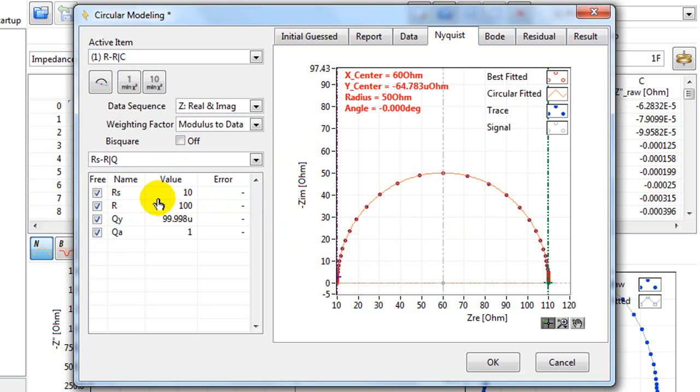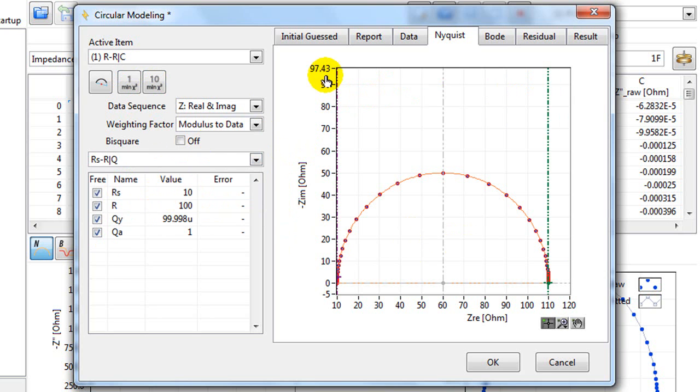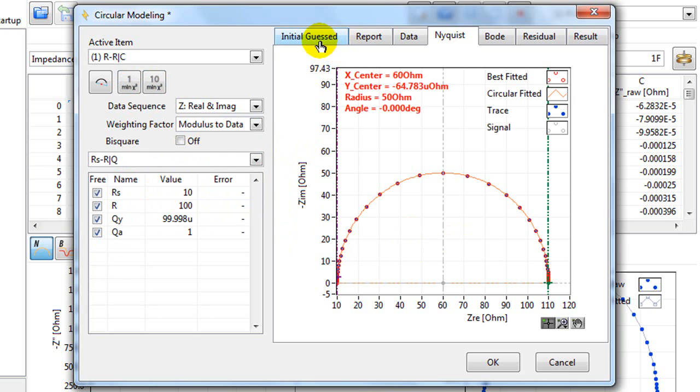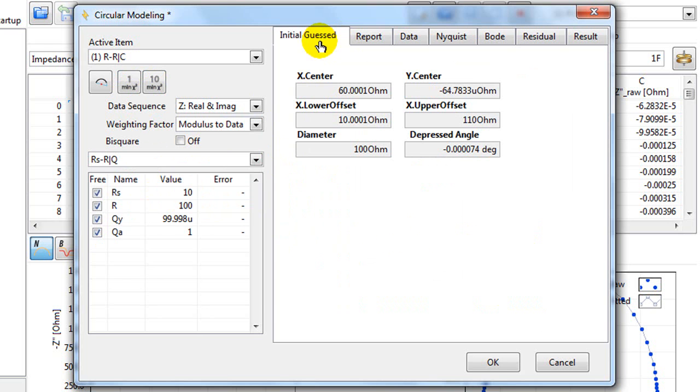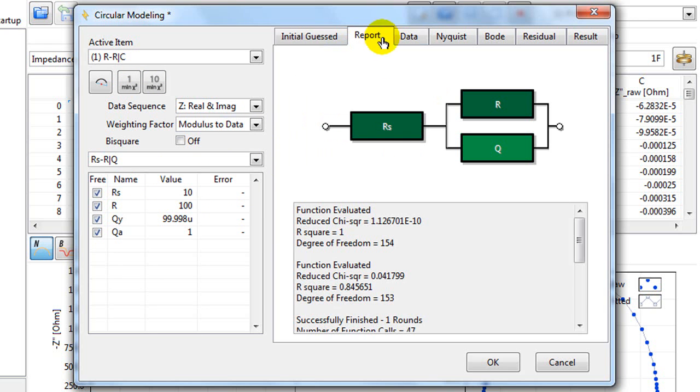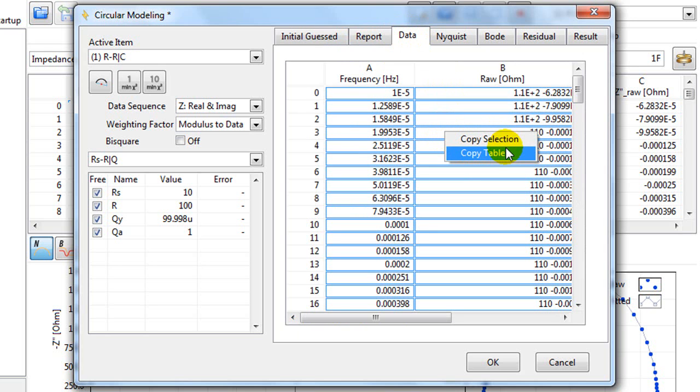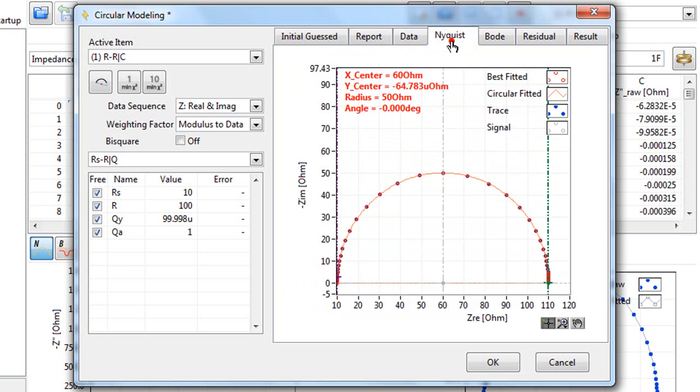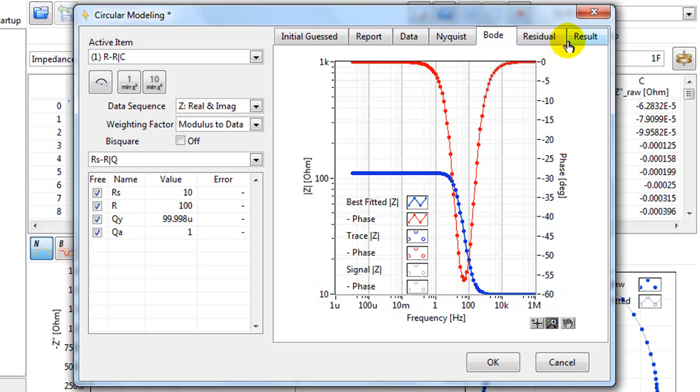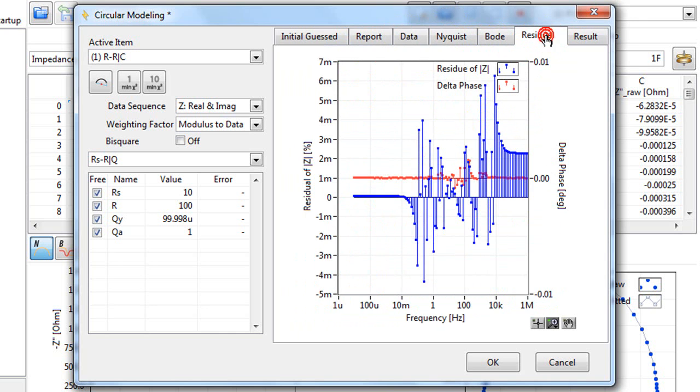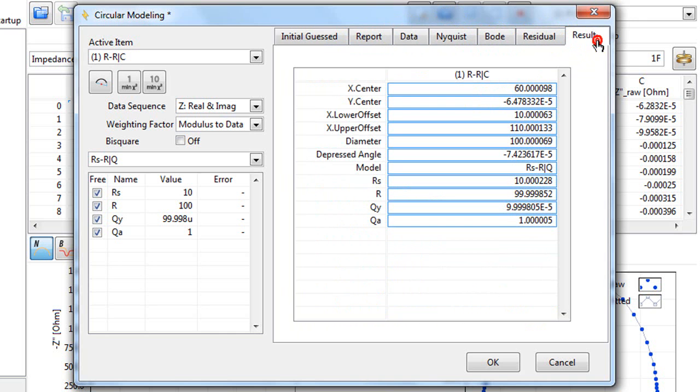You can now see the results in these tabs. This is the initial guess. The report. The data. Remember, you can right click here to copy the selection or copy the table. This is the Nyquist plot, the Bode plot, the residual plot and the result. Again, you can right click and copy.